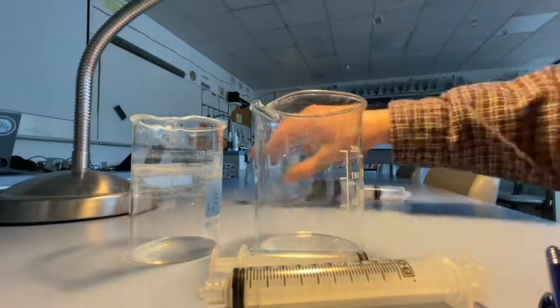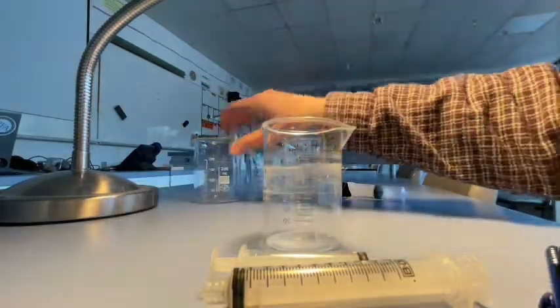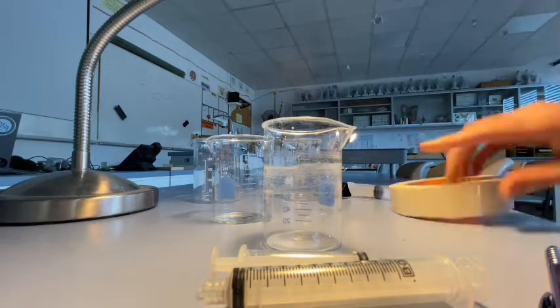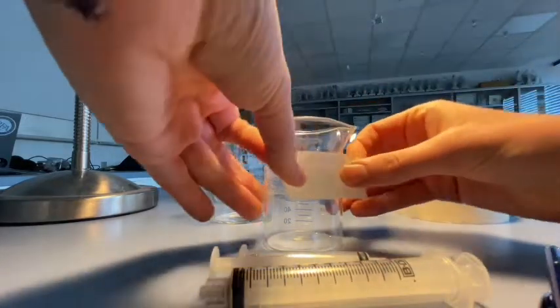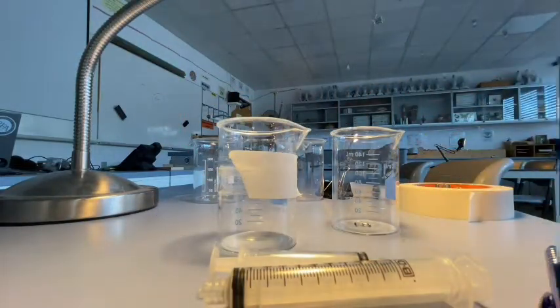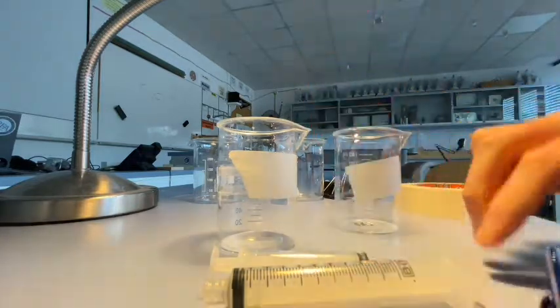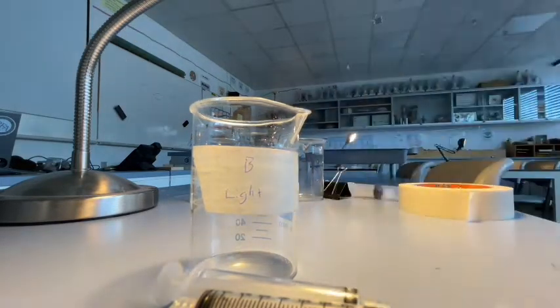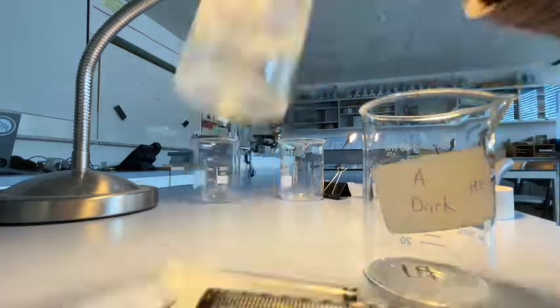So just to give you the student's perspective, I'm going to be labeling my beakers, one for the dark experiment and one for the light experiment. So students can get a piece of tape and apply that on in the first period. By the second period, it'll already be on there. The second period will have to take the tape off. Now, different teams will be under the same light, and so it's good to put your initials here as well. Okay, so I'll mark this one with my initials.